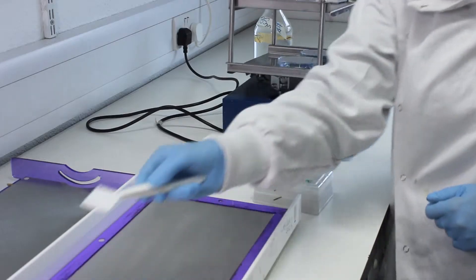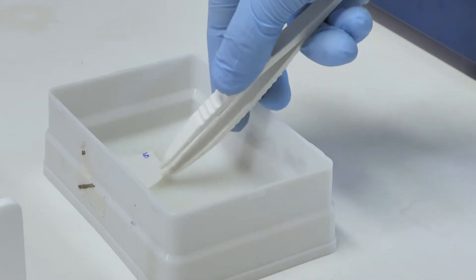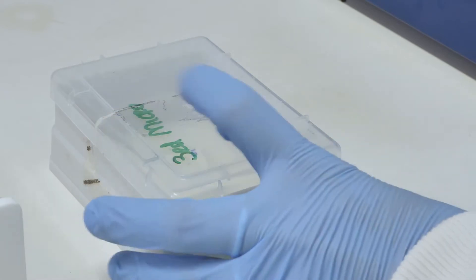The membrane is added to a clean sandwich box containing blocking solution and incubated for at least one hour at room temperature with gentle rocking.